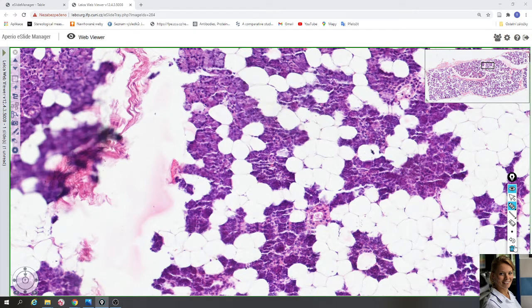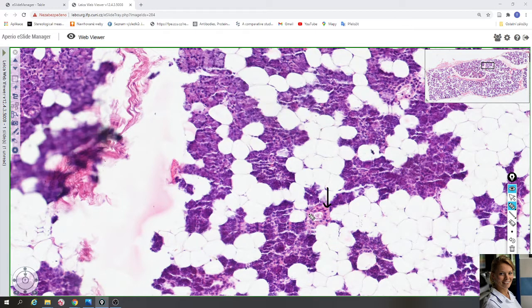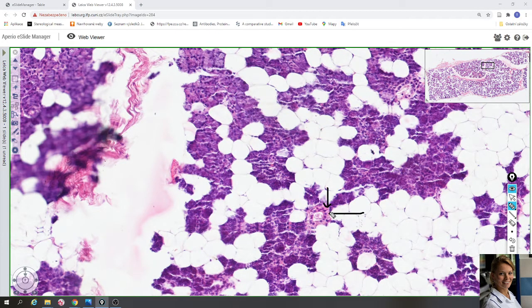The secretory product from the intercalated duct drains into a larger striated duct. Here you can see a striated duct — these ducts have large lumina and are lined by simple columnar cells that exhibit basal striation. The striations are formed by deep infoldings of the basal cell membrane, and between the infoldings are numerous mitochondria. These cells are eosinophilic because they contain many mitochondria in their cytoplasm.